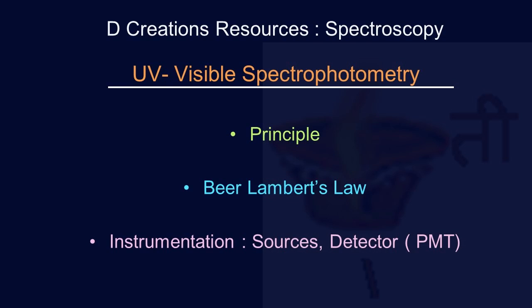We'll talk about PMT in detail, but before that, let me just mention that a photodiode, of course, is a semiconductor device, and it's going to convert light into electrical current. The principle it would use for that is the photoelectric effect, where photons, which are the particles associated with light, hit the diode, and that generates electron hole pairs. So there is a flow of electric current when you apply voltage. Gallium arsenide, that is GaAs, or indium gallium arsenide, that is InGaAs, also are materials apart from silicon which can be used for making a photodiode.